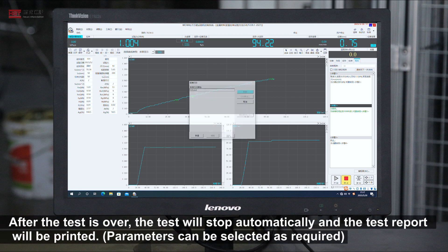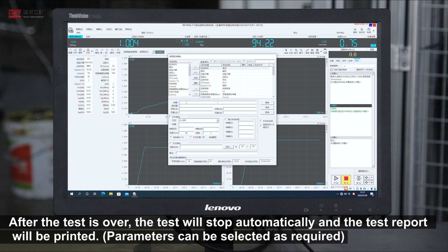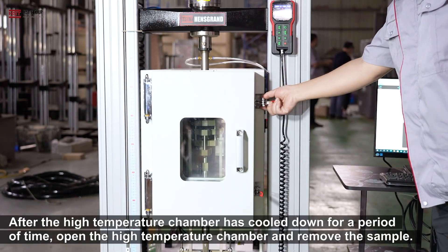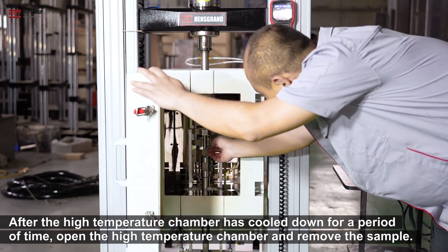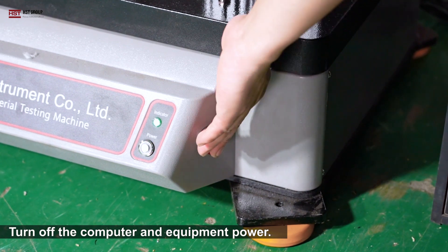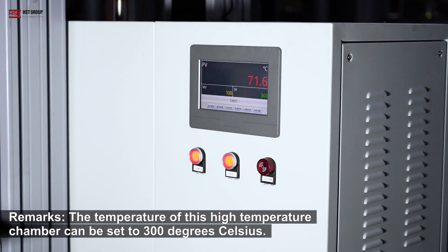After the test is over, the test will stop automatically and the test report will be printed. Parameters can be selected as required. After the high temperature chamber has cooled down for a period of time, open the high temperature chamber and remove the sample. Turn off the computer and equipment power. The temperature of this high temperature chamber can be set to 300 degrees Celsius.